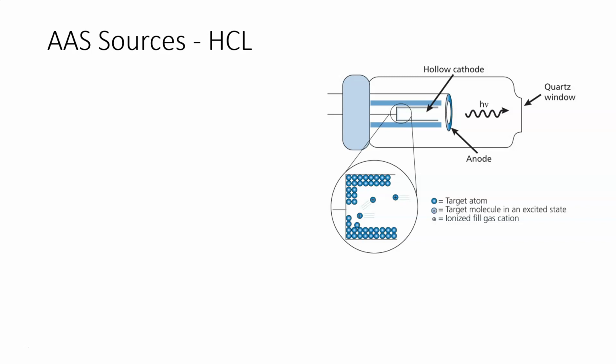Hello folks, we are going to continue our discussion of atomic absorption spectroscopy from chapter 7. We left off talking about the different sources of broadening and doing the block diagram, the simple block diagram. We're now going to elaborate on those different types of sources as well as different types of sample introduction.